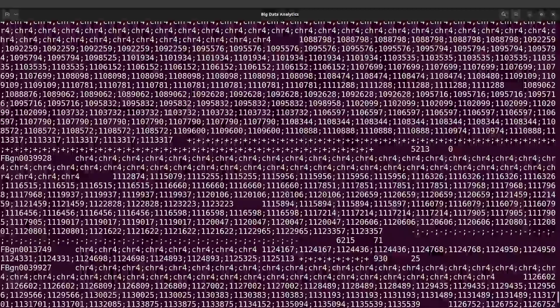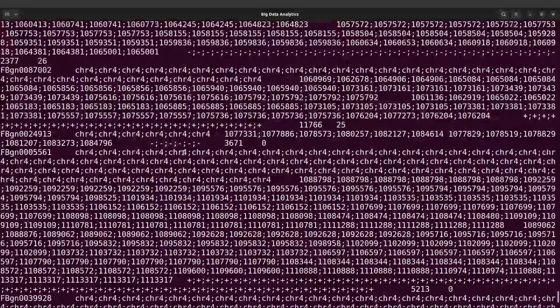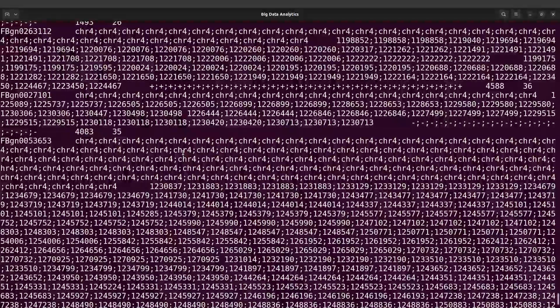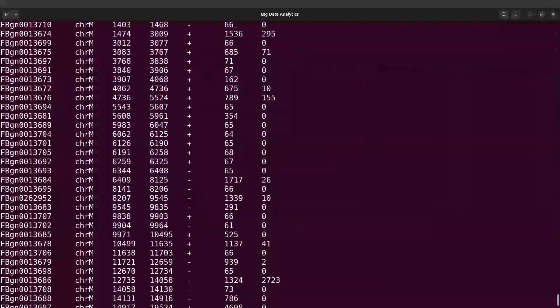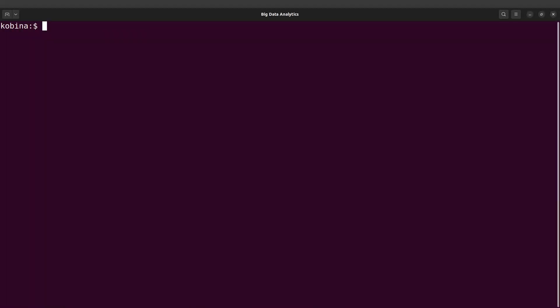There is other information here as well. I'll leave the full documentation to featureCounts so you can read more about the outputs, but we are going to explain them later on. For the summary file, which gives you a good overview, that one is also here.